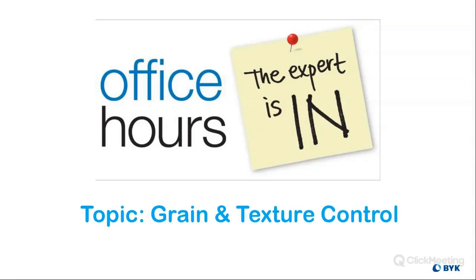Ooh, that's a good question. You might have won Stump the Corey, John. I would imagine there could be some difficulty with the illumination causing glare on the glass and maybe messing up those measurements. But again, there is only one way to find out. And if you have any ability to let us take some measurements of your samples, we can certainly at least give it a try and see.